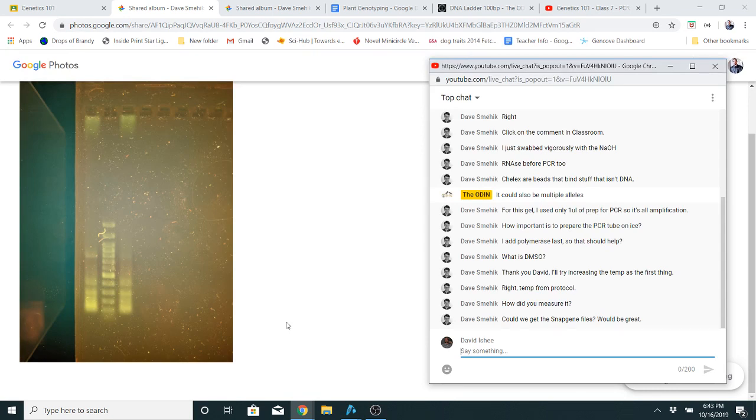So that's what I would do. For you, Dave, I would raise the temperature, I would do a negative control, I would prep it on ice, and go directly from the ice to a hot thermocycler. But I think that's about it. Any last second questions? I'll give it a couple more minutes, otherwise we'll probably end early if we don't have any more questions.